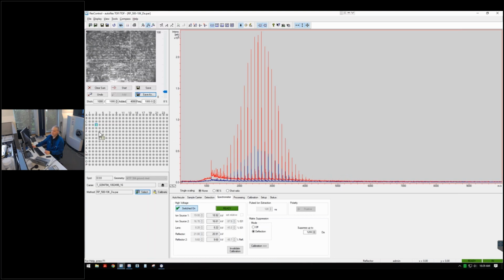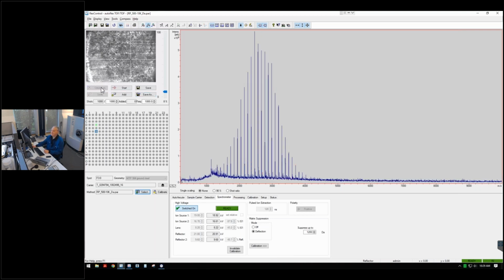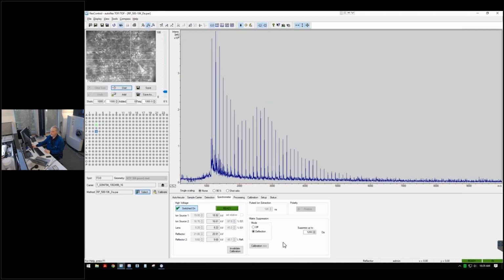So also what we're going to do is collect a spectrum of a polycaprolactone. And this should give you an idea of the broader molecular weight. So here we see with this blue spectrum, we have a nice narrow polydispersity, again, MW divided by MN, and a nice Gaussian or bell-shaped curve. But with this second analyte, what we're going to see, let me reduce the suppressor. There's some ions that are obviously coming out a little earlier, so let's take this down to like 800.